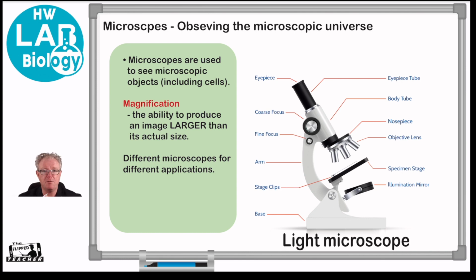For example, the tip of a ballpoint pen, or you might want to investigate soil. If you're a forensic scientist, you want to pinpoint your suspect to a crime scene, so you look at the soil that you scraped off the bottom of their shoe, and you might find that there's certain types of pollen in the soil, or there's certain types of other inorganic matter, bits of sand and stuff that you can say, hey, that's the same sand as the crime scene. So you might be doing that. But the whole idea with a microscope is that you're magnifying things.